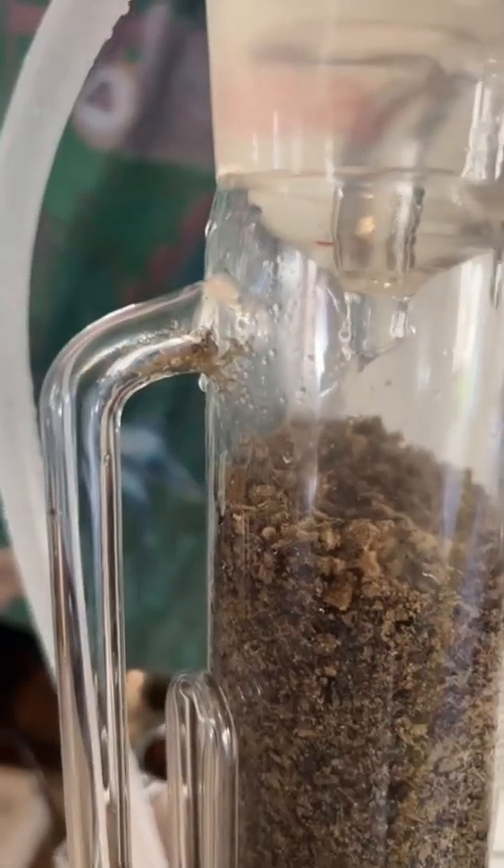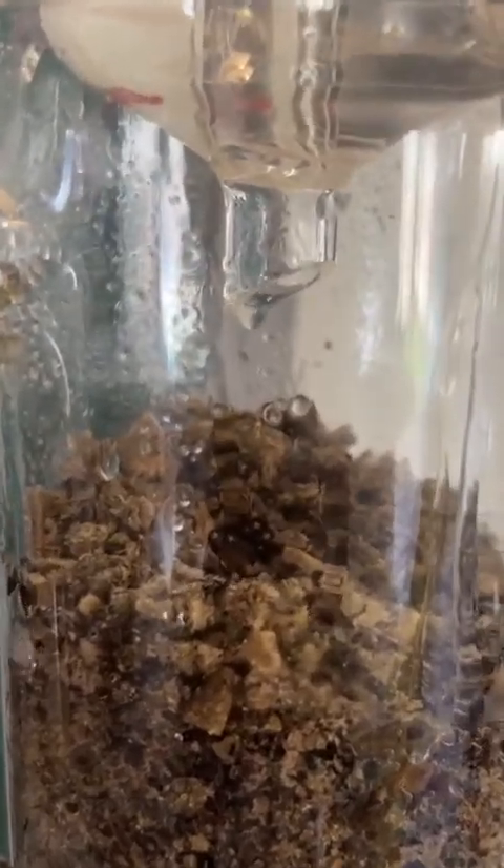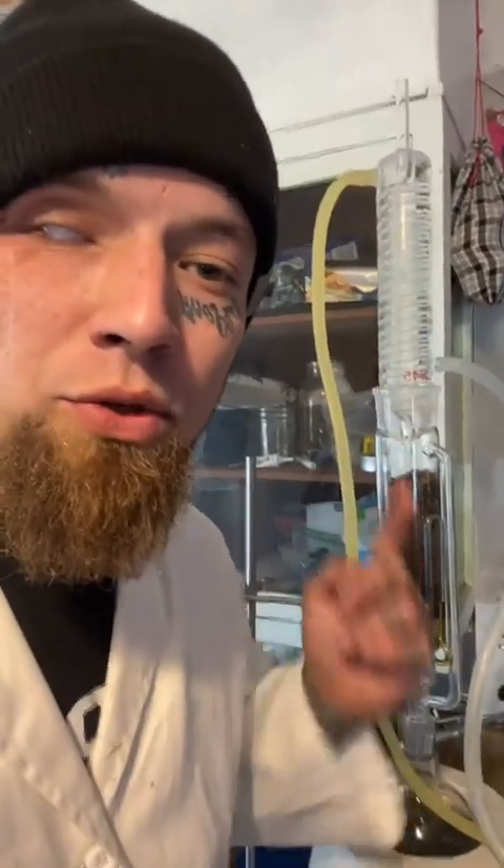You can see the gas just now hitting the chamber, and there is the reaction. This also allows you to be very accurate with your ratios. I have 1,000 grams of solvent here and 50 grams of mullein — right now this is a 20 to 1 ratio.